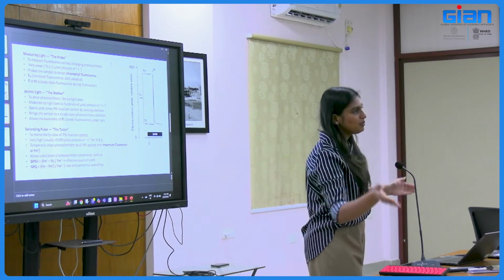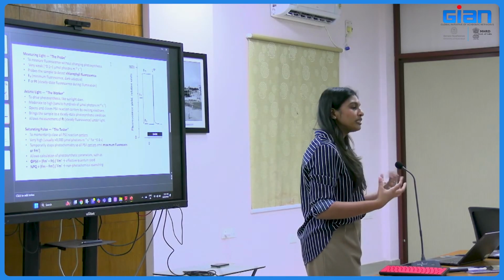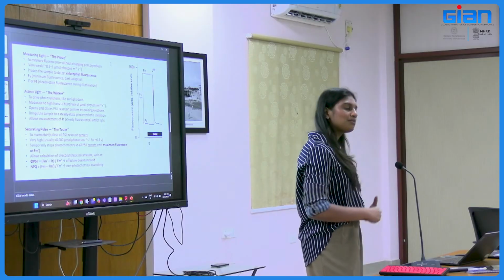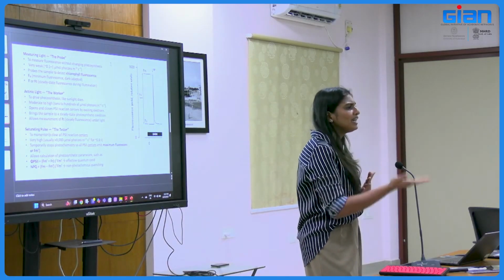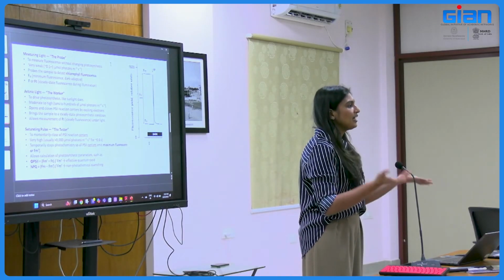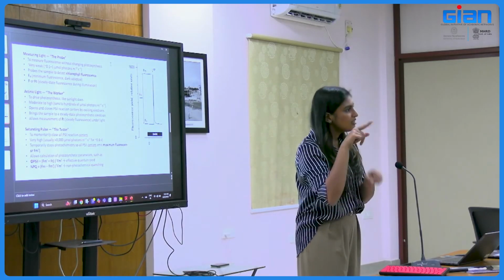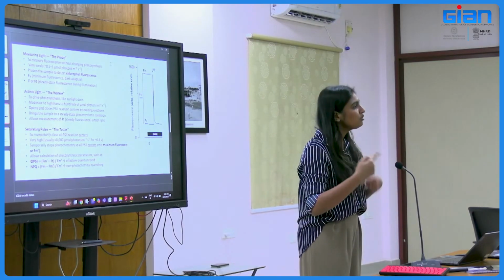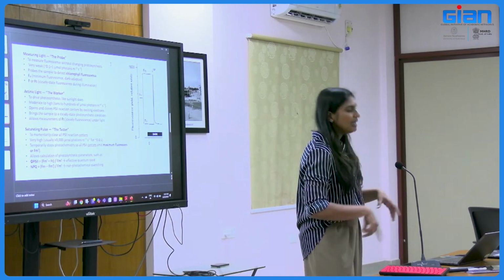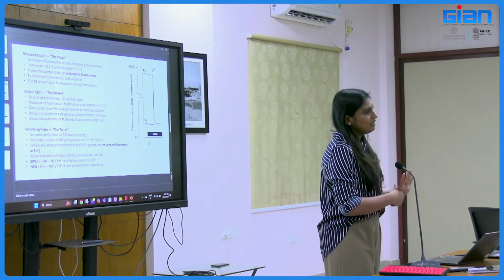Okay. So depending on the experiment, you will use these lights according to your need. You may want to close the complete PS2 reaction center and just see the maximum fluorescence, or sometimes you do some kinetics also. Kinetics basically means how the electron transport is going. If you again give a saturating pulse, what will happen? These kinds of experiments you can also program according to your purpose. So there are a lot of options within dual PAM you can use. Today we will only cover the basic light curve, which will give you a lot of parameters.